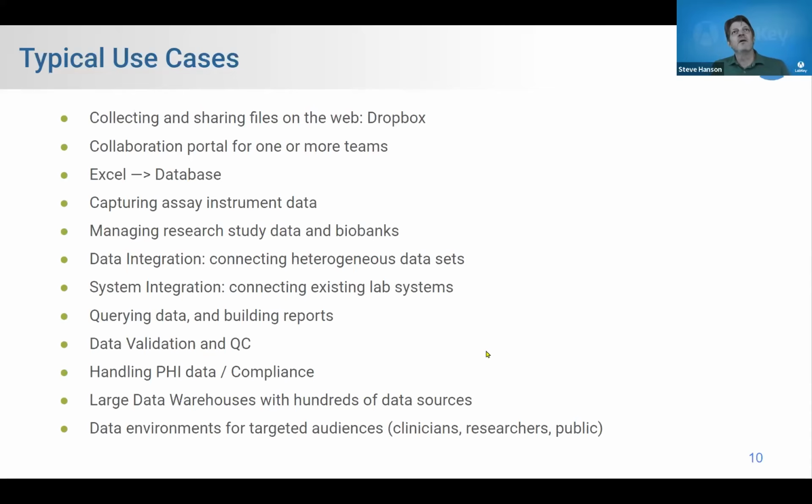But you've got great advantages too, because when you have structured data, your reporting and your interrogation become infinitely easier, or just downright possible. You can do things like join data with other data much more effectively. You can validate your data and clean it up much more effectively. You can keep bad data out and get good data in. There are lots of advantages to working with a database, and this is one of the great advantages of LabKey. It's fundamentally data in a database. And on day 2, we're going to do a deep dive on what that database really means and what it can do for you.